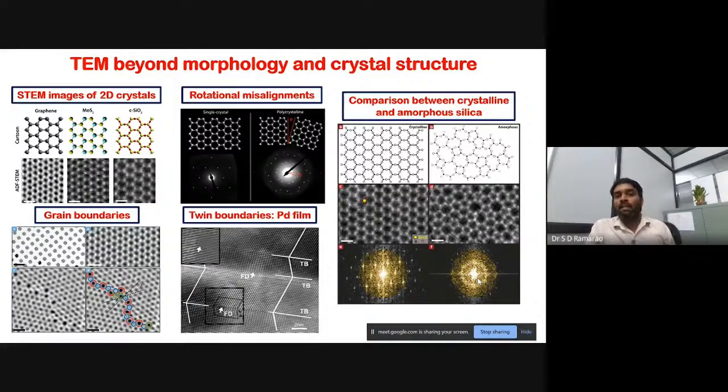There are many things, like, instead of single layer graphene, if you have another graphene layer, they put it on top of that and tilt it at some angle, and because of that tilting you can probe magnetism in the graphene. So in order to show how much angle it is tilted, and to confirm that, you need to show your TEM results as supporting evidence.